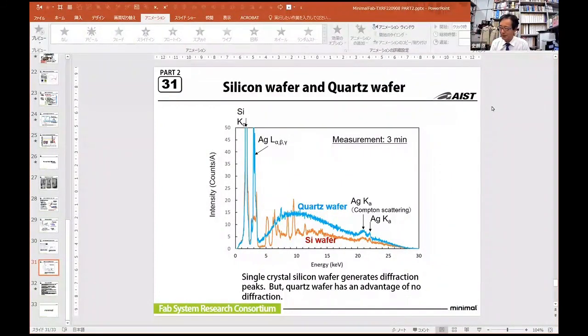Can I have a cross-check with another method, like ICP mass spectrometry? Yeah, we did it. We use ICP mass, of course. We had a reasonable result, no discrepancy. Cross-checking the destructive method and this non-destructive method is very difficult.